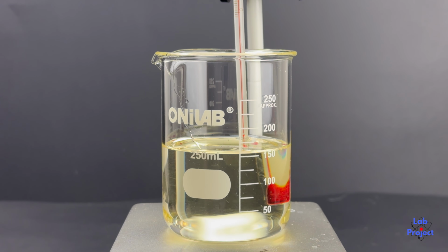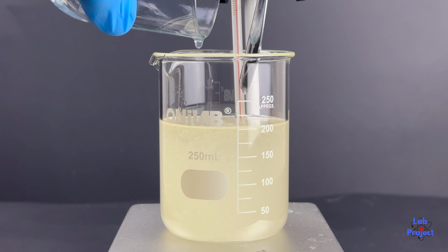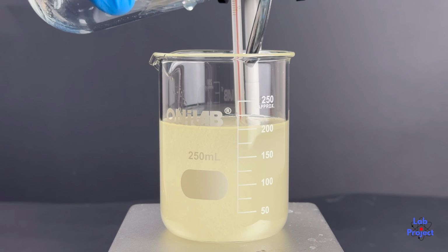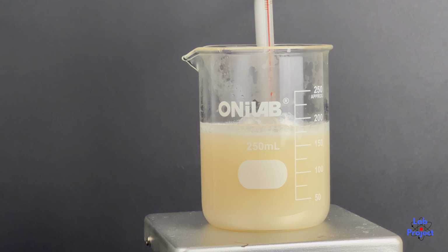I heated the oil, added sodium hydroxide and methanol, and left it in the beaker for a few hours to see whether the gelatin-like material would form again. Unfortunately, after just a few hours, I observed the same thing. At this point, I honestly don't know what I'm doing wrong.